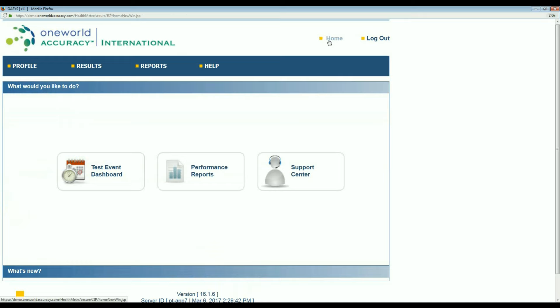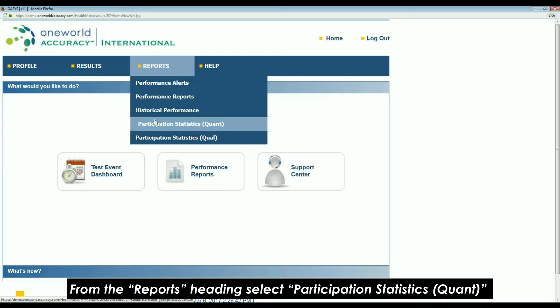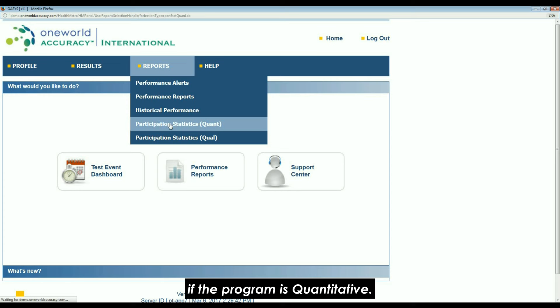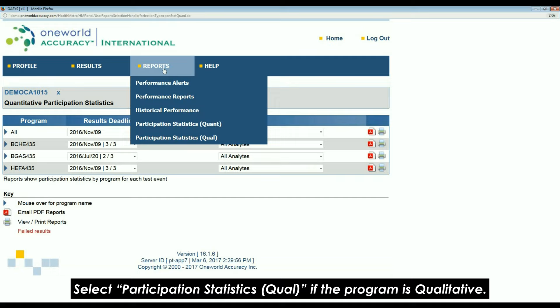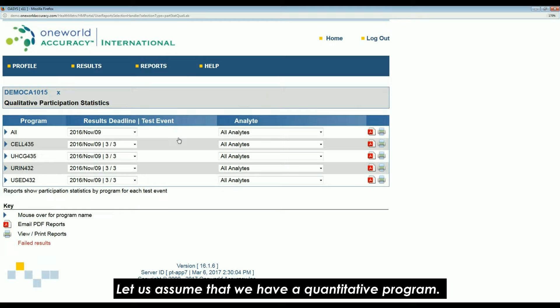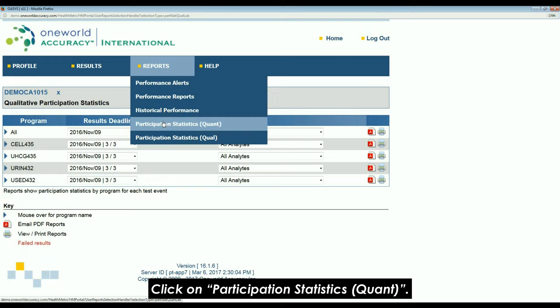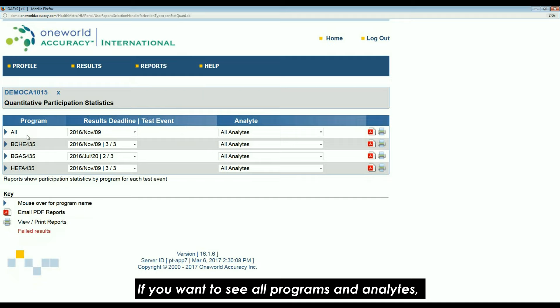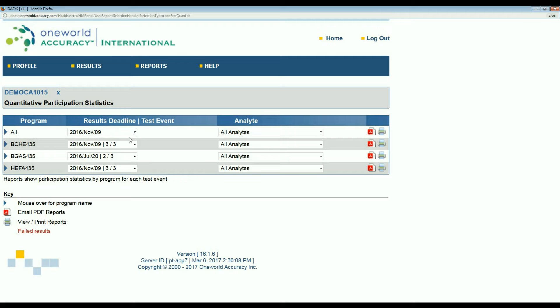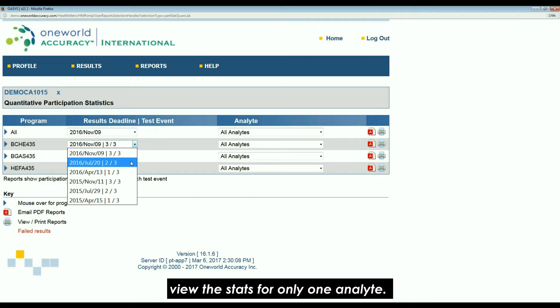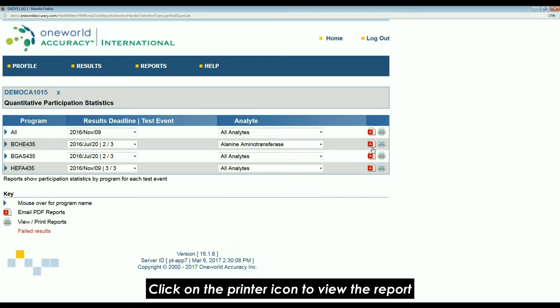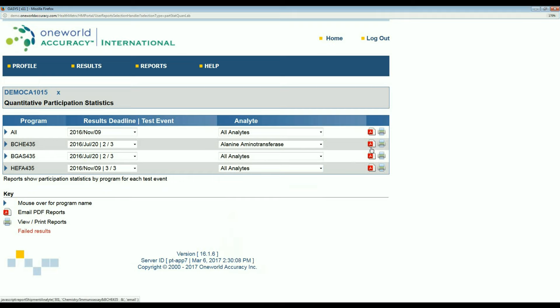To access the participation statistics for a program, first check if the program is quantitative or qualitative. From the report settings, select participation statistics quant if the program is quantitative, or participation statistics qual if the program is qualitative. Let us assume that we have a quantitative program — click on participation statistics quant. If you want to see all programs and analytes, you can choose all on the first row. Select a deadline for a program and an analyte if you wish to view the stats for only one analyte. Click on the printer icon to view the report or on the PDF icon to email it to yourself.